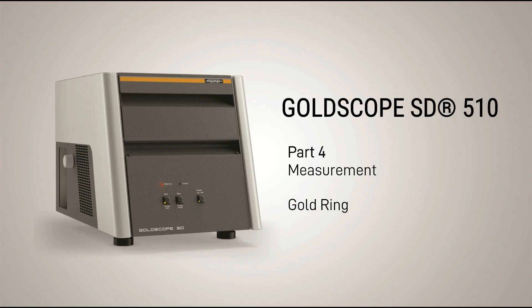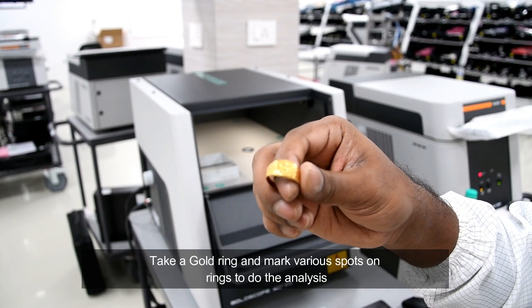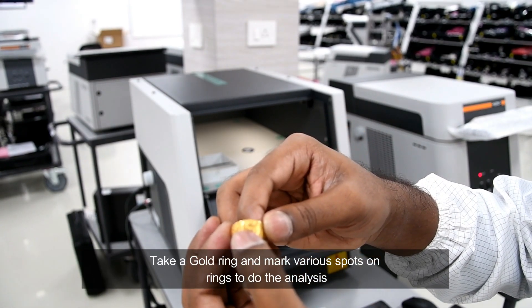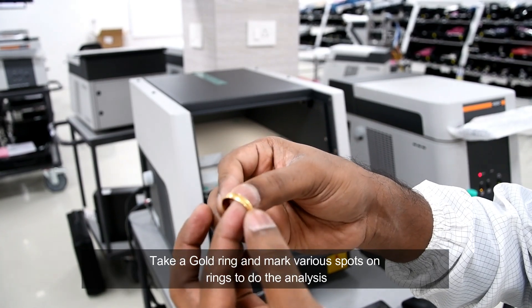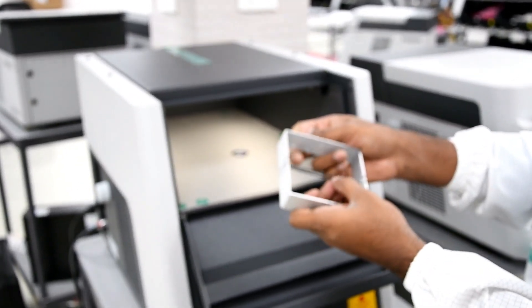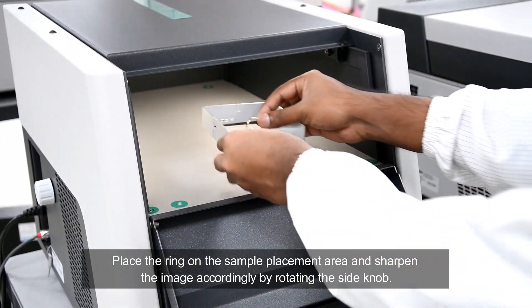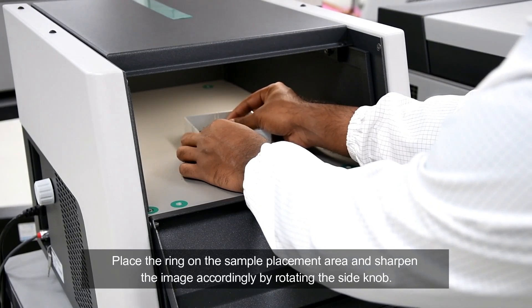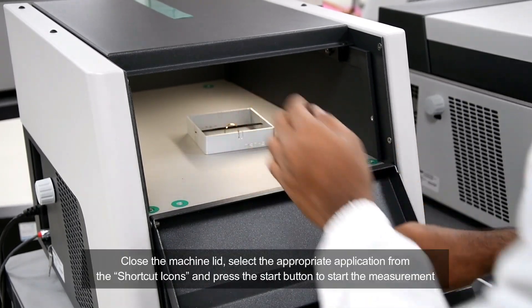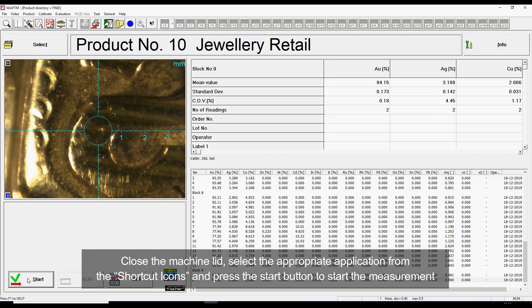Let us understand how to do precious metal analysis with the Fisher Gold testing machine. Take a gold ring and mark various spots on the ring to do the analysis. Place the ring on the sample placement area and sharpen the image accordingly by rotating the side knob. Close the machine lid, select the appropriate application from the shortcut icons, and press the Start button to begin the measurement.